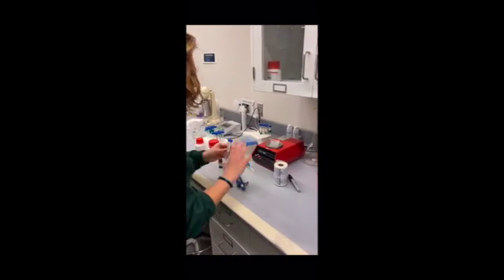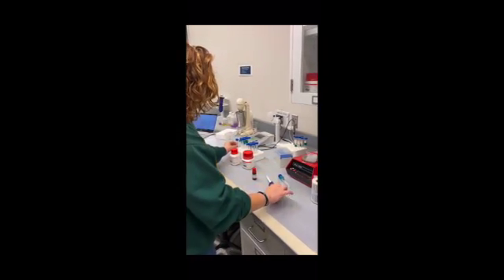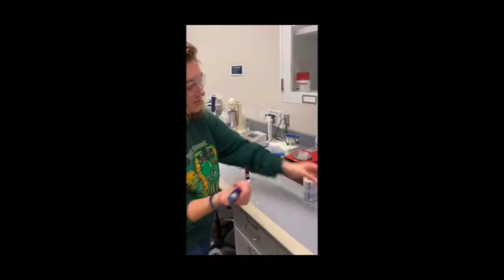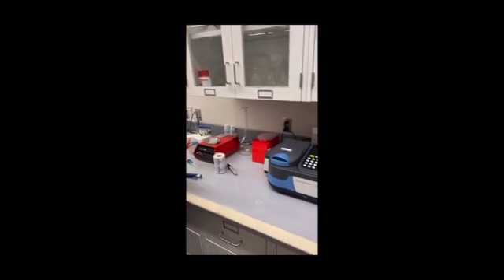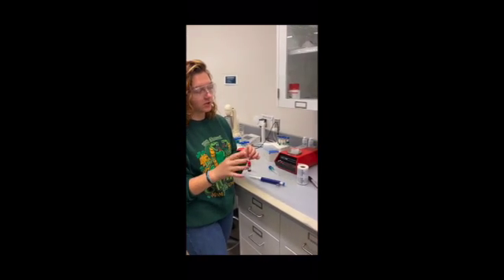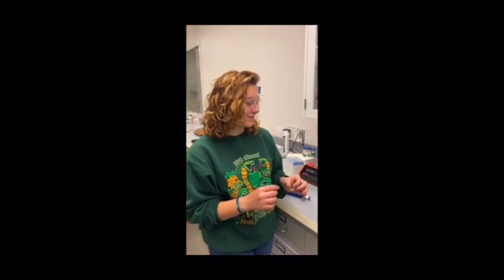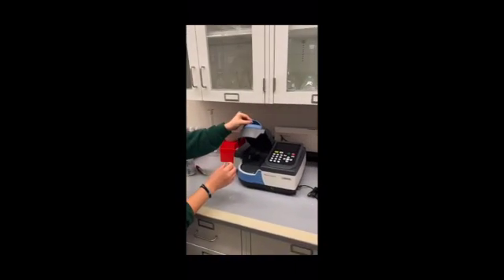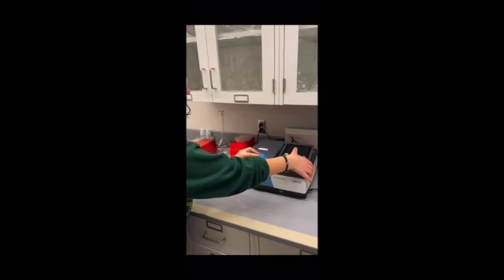Once you add the enzyme, invert to mix, and then take some of that into an assay. As soon as the enzyme was added, we would start a stopwatch, so that we could record how long the enzymatic reaction was going on, and then immediately place the assay into the spectrometer, shut, and read absorbencies.